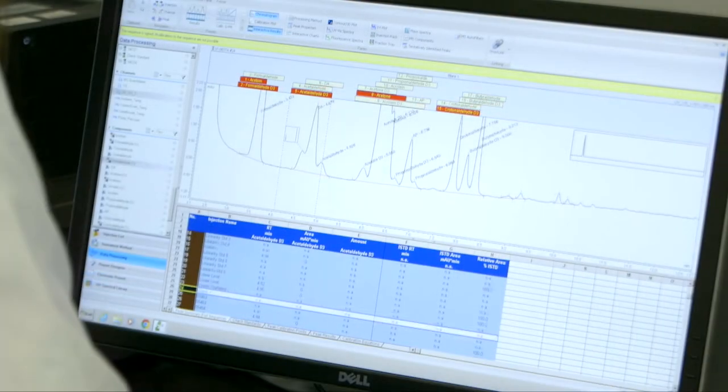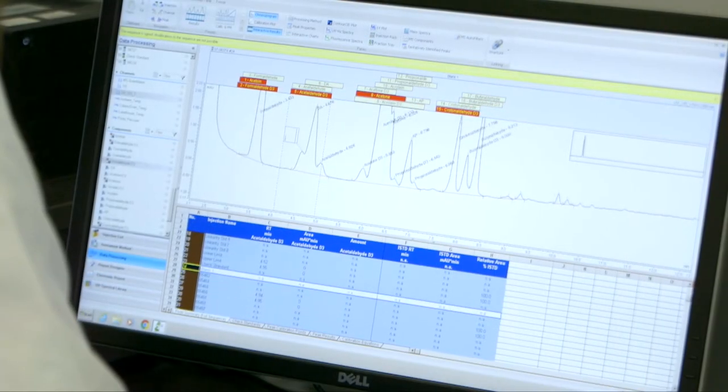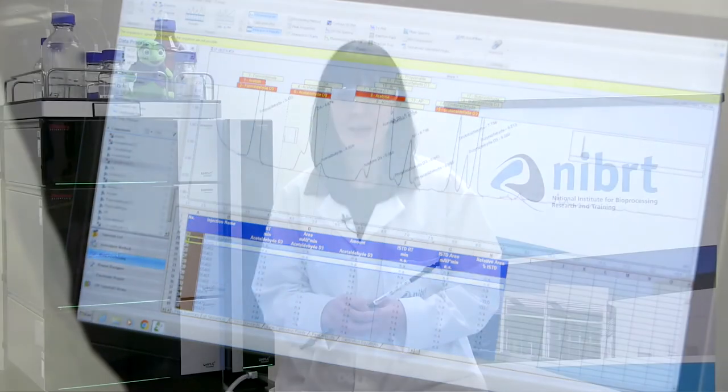Size exclusion chromatography is standardly used for aggregate analysis, however compounds may show non-specific binding to some size exclusion columns, leading to retention time shifts, peak tailing and even loss of peaks.